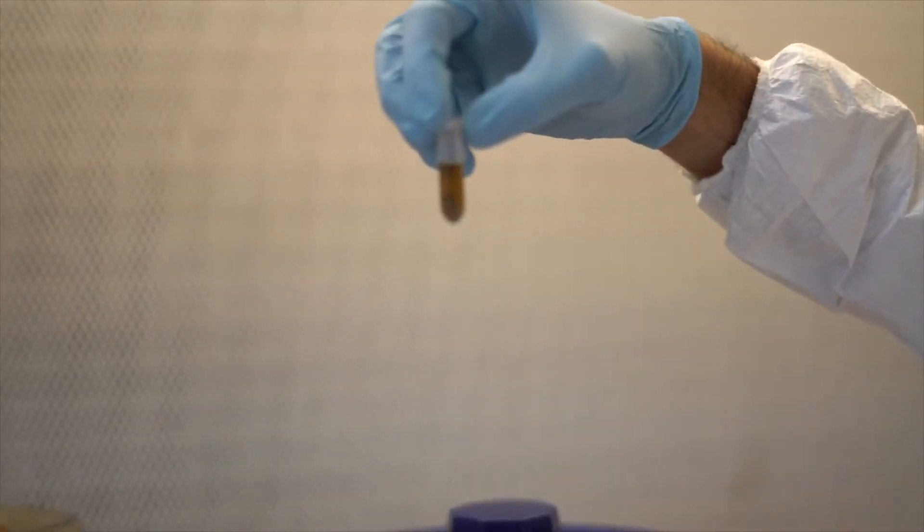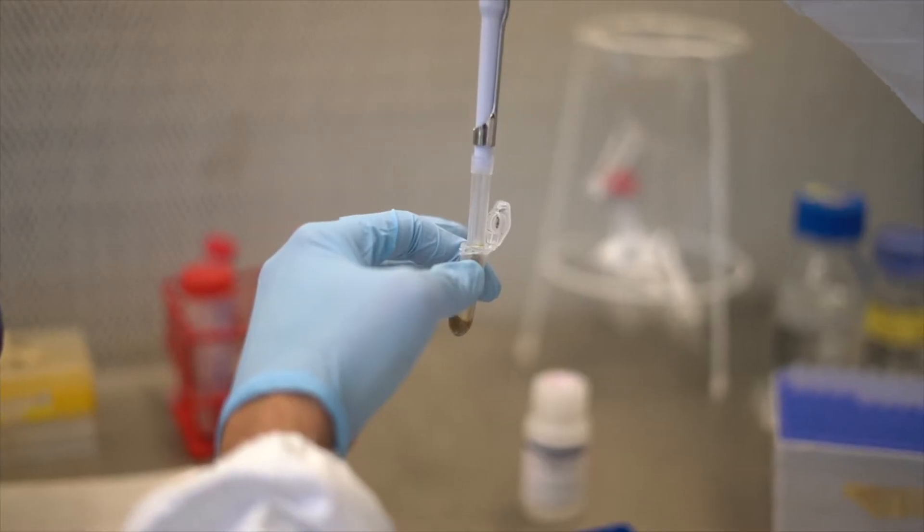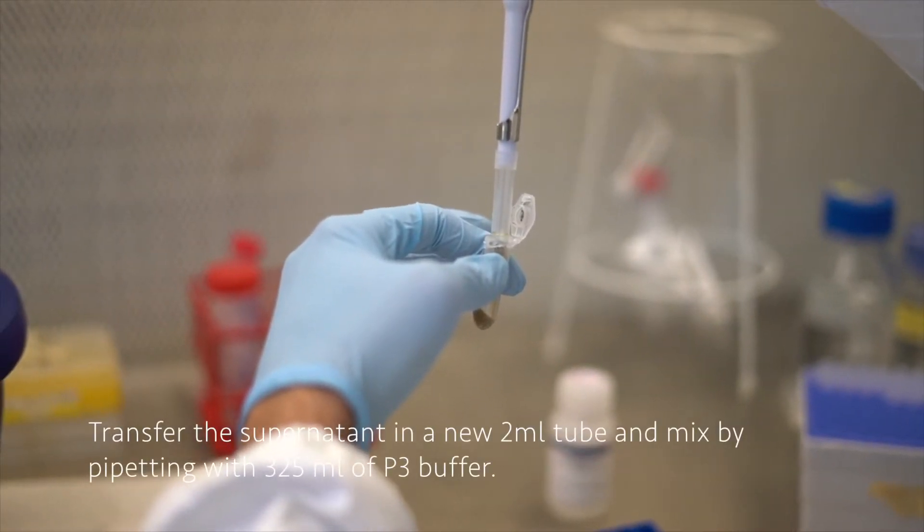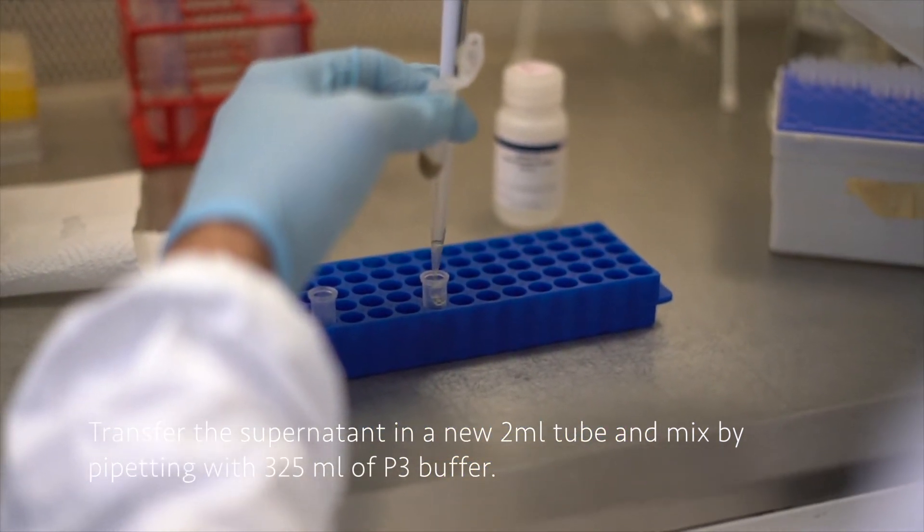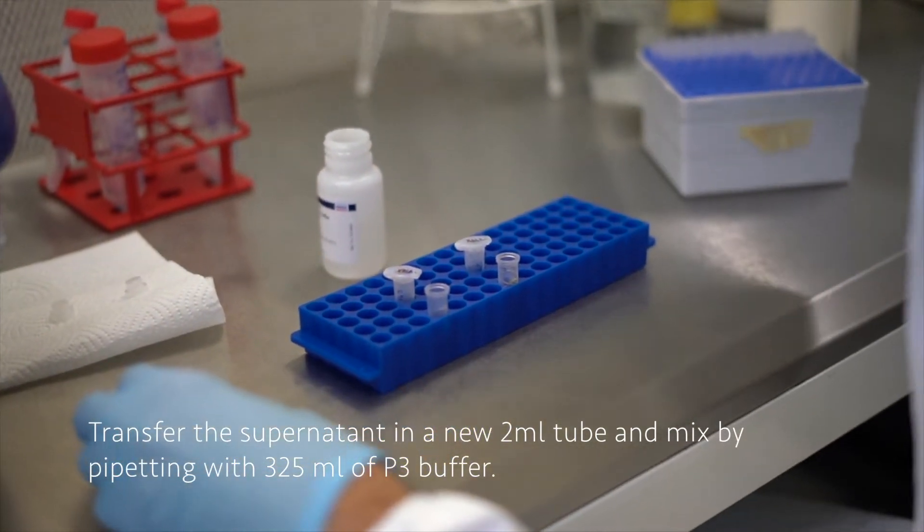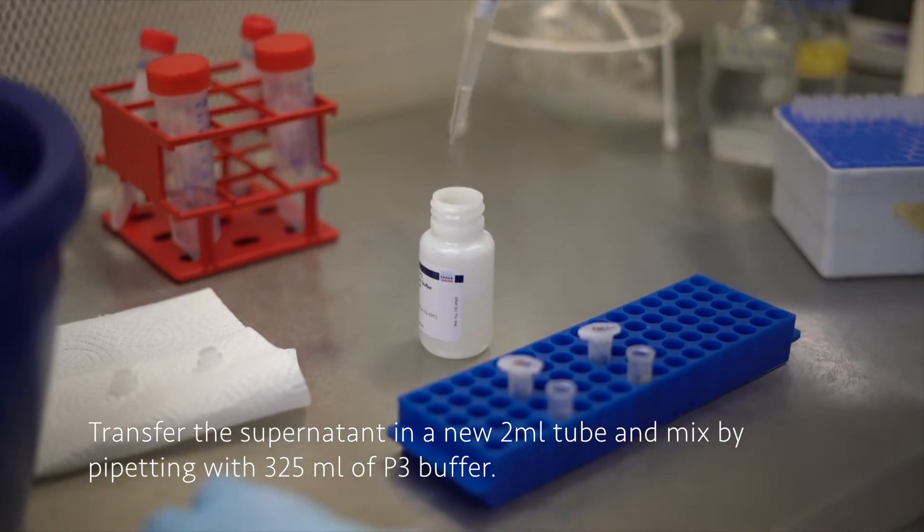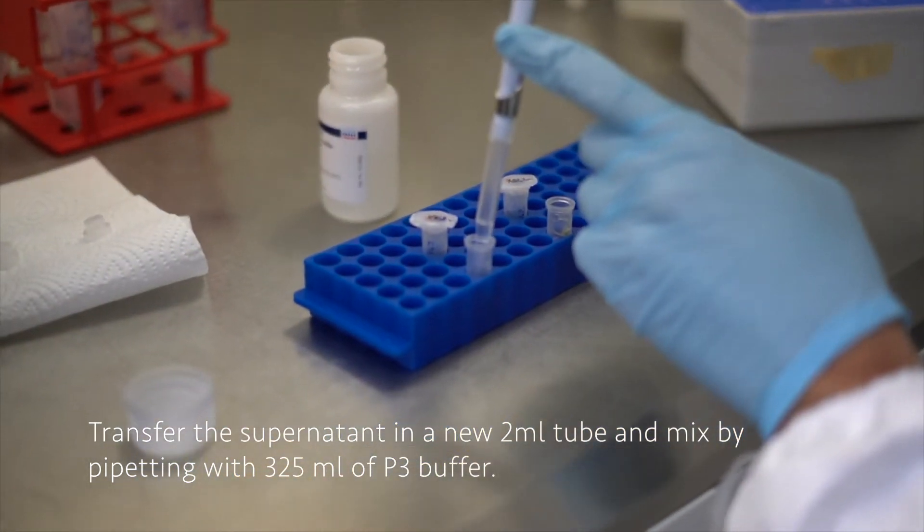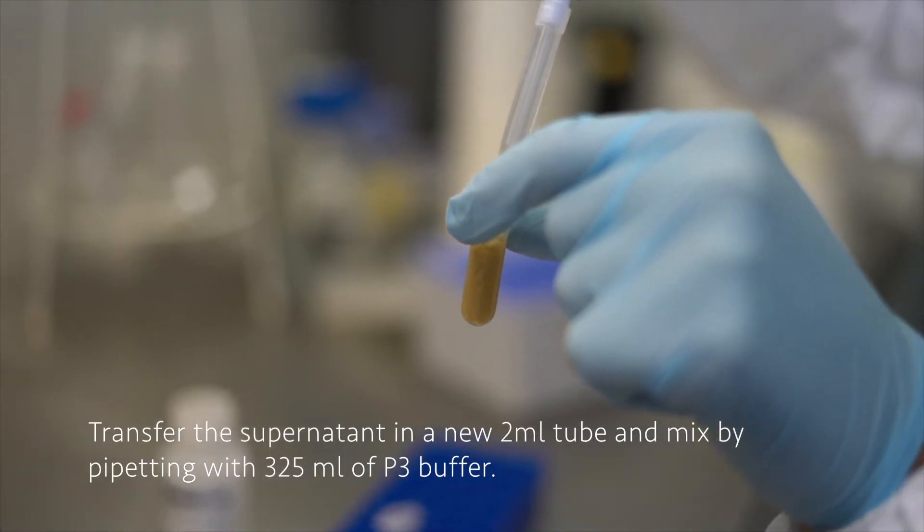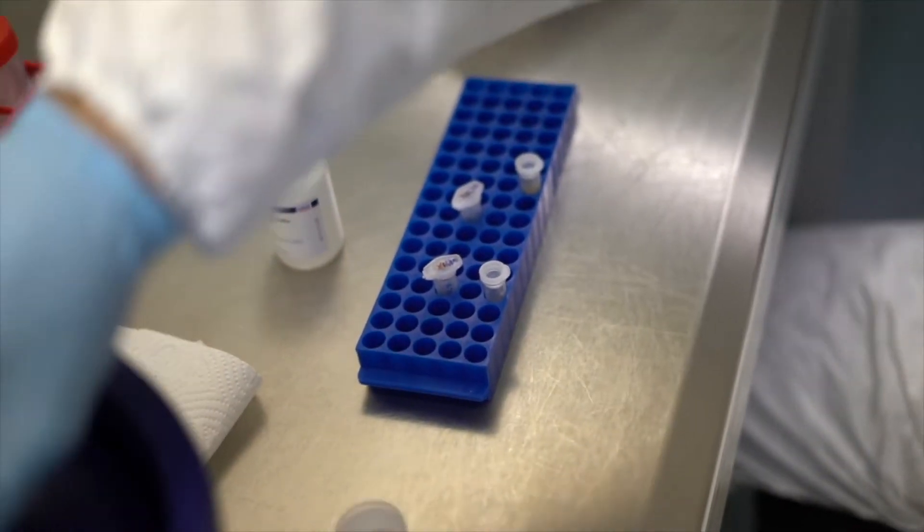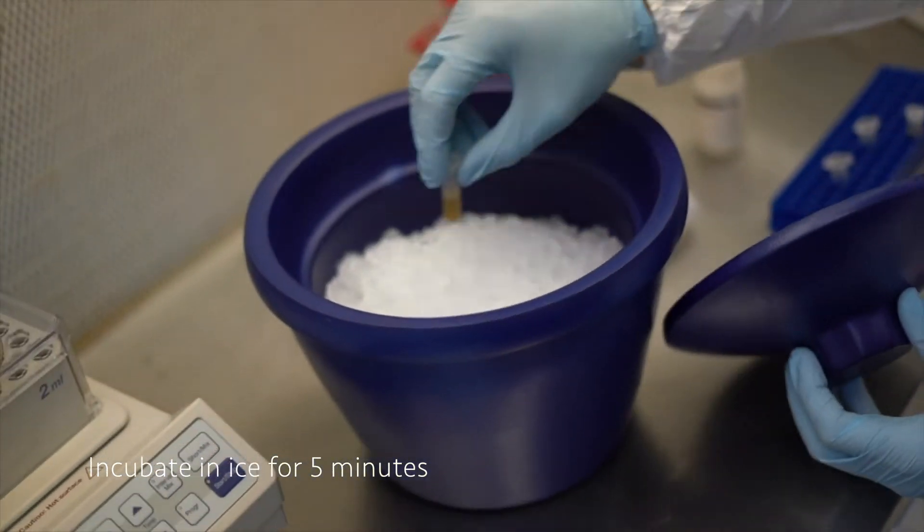After centrifugation you can see there is something sedimented on the bottom of the tube. We have now to take the supernatant, more or less 1.2 milliliters, place in a new 2 milliliter tube, and then mix it with 325 microliters of P3 buffer. We can mix by pipetting, the solution will get whitish and somehow also dense. Now we can incubate them in ice for five minutes.